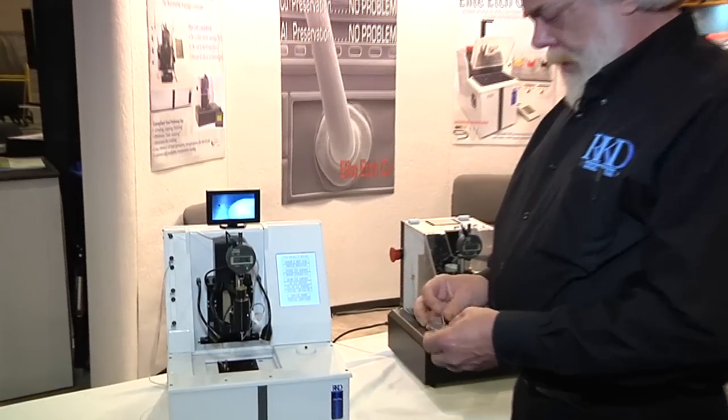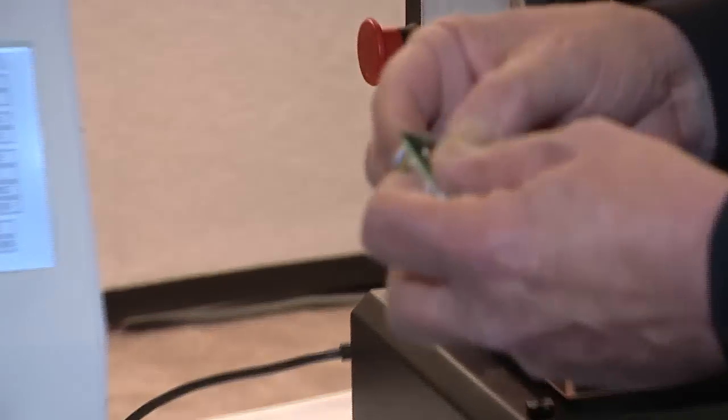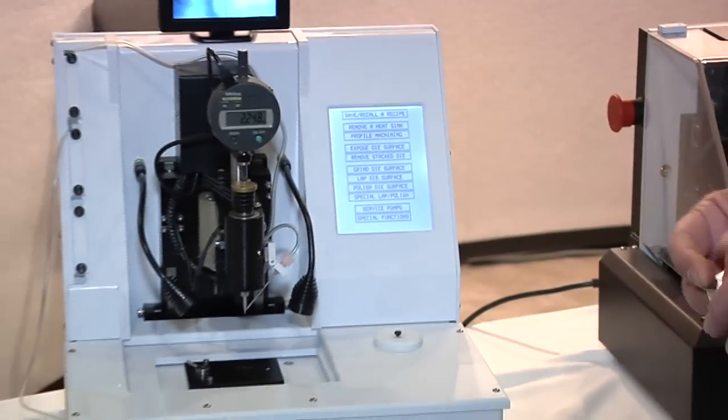It requires mounting the package onto a holder. The holder is supplied with the machine, as is the hot plate for doing the mounting.